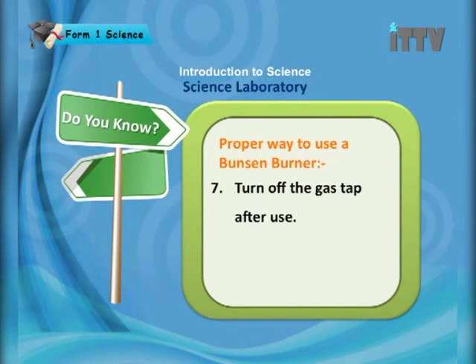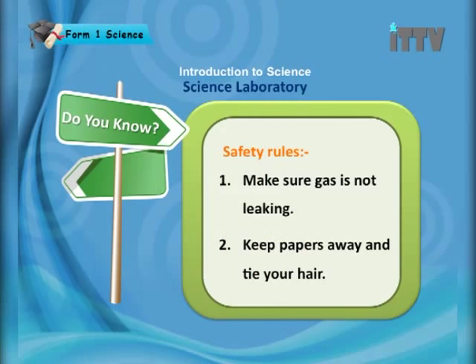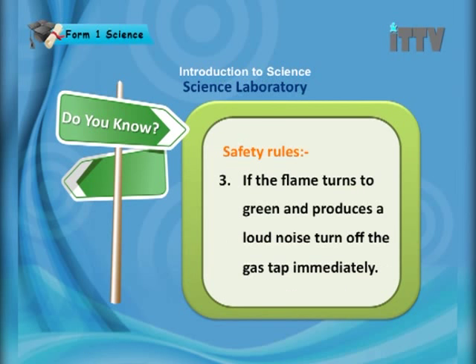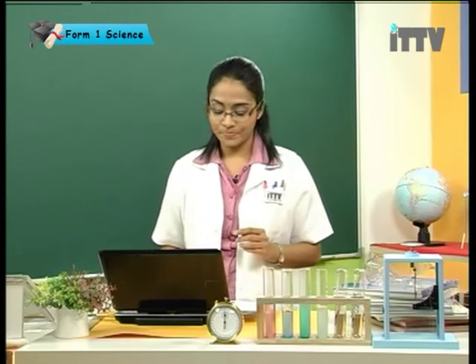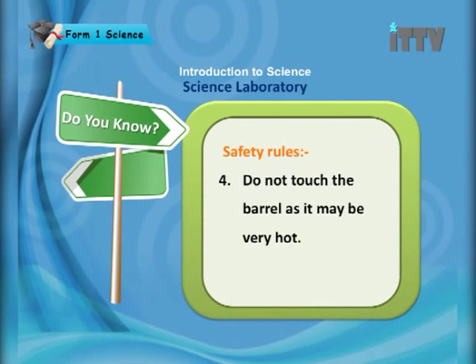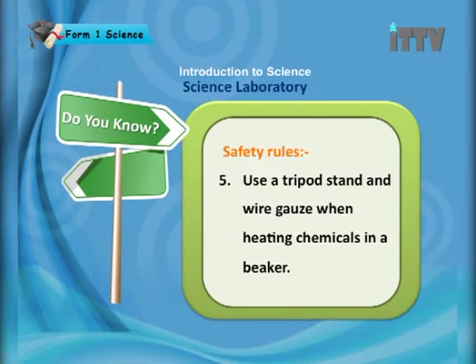Turn off the gas tap after use. Safety precautions when using a Bunsen burner: make sure gas is not leaking; keep papers away and tie your hair to prevent fire. If the flame turns green and produces a loud noise, turn off the gas tap immediately. Do not touch the barrel as it may be very hot. Use a tripod stand and wire gauze when heating chemicals in a beaker.